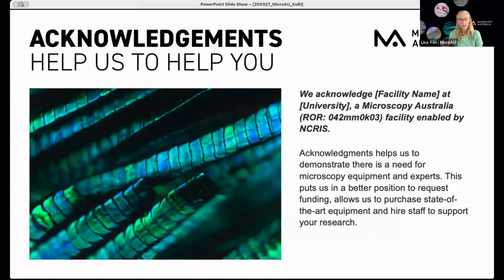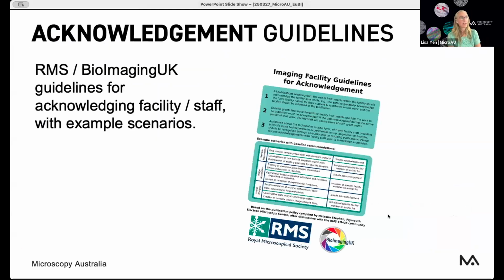So in Australia, one of the things that we do is we develop things like this that can be used as a desktop wallpaper or as a screensaver on computers that can then be varied or revised depending on which particular facility they're at. And of course, similarly, the Royal Microscopical Society has also been working with Bioimaging UK to develop some facility guidelines. And I know Global Bioimaging is similarly trying to work on a version that could be jointly shared and promoted.